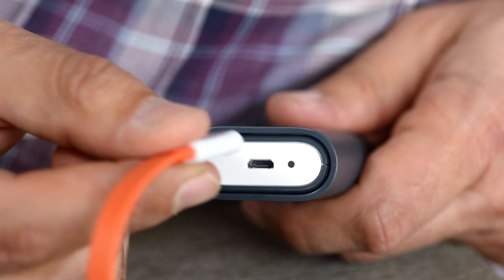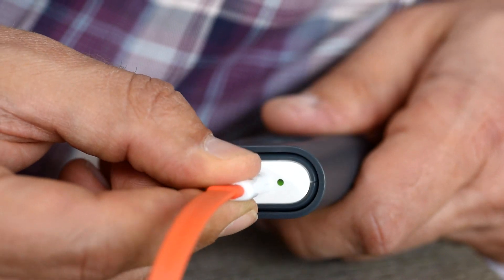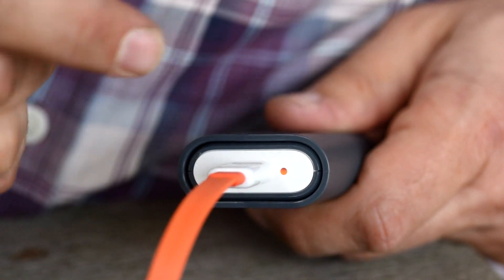Before using Sayo, make sure you charge it for a couple of hours until the LED light turns green.